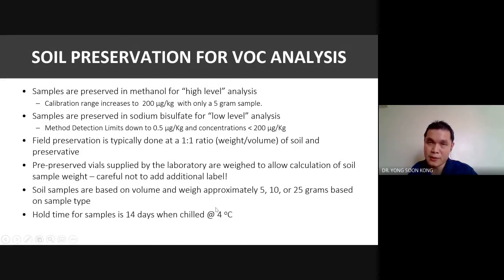If you put it at 4 degrees, most likely bacterial degradation will be reduced. However, the oxygen in the container might still continue with the chemical degradation, the oxidation. And as a result, what happened to your VOC? Slowly they will decrease, very slowly.